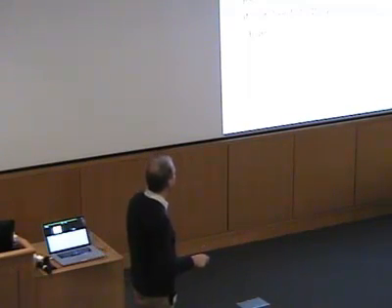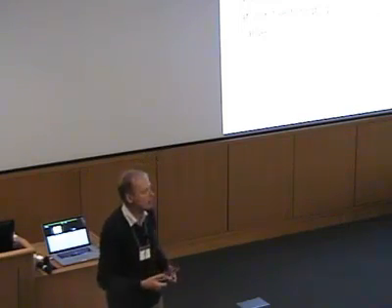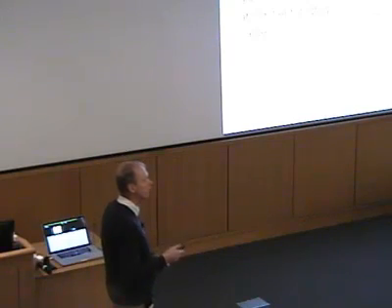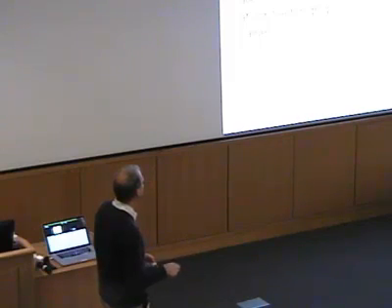And so what we can see in this system is a transition at the normal field for the plus minus 1/2 levels, but we have a large shift in the transition between these two levels here. And so in systems like this, we start to see features in our spectrum which are shifted very far away from where the free electron would be. Right? So you can calculate an effective G value for a transition like this.